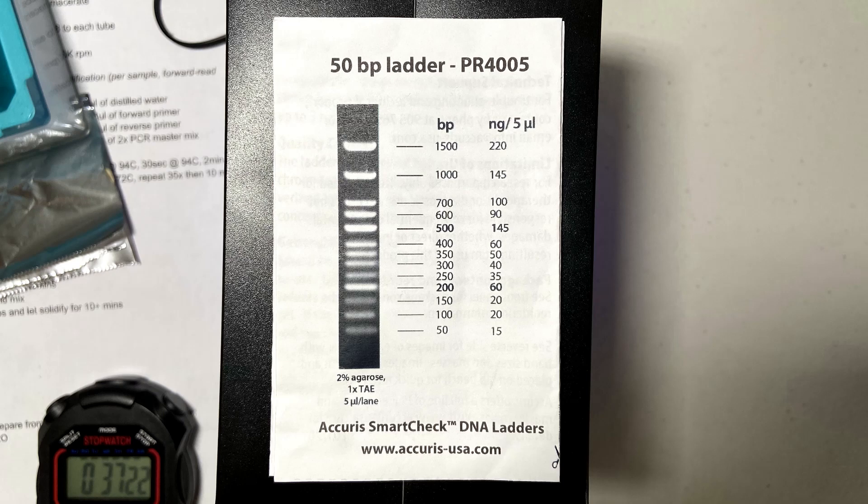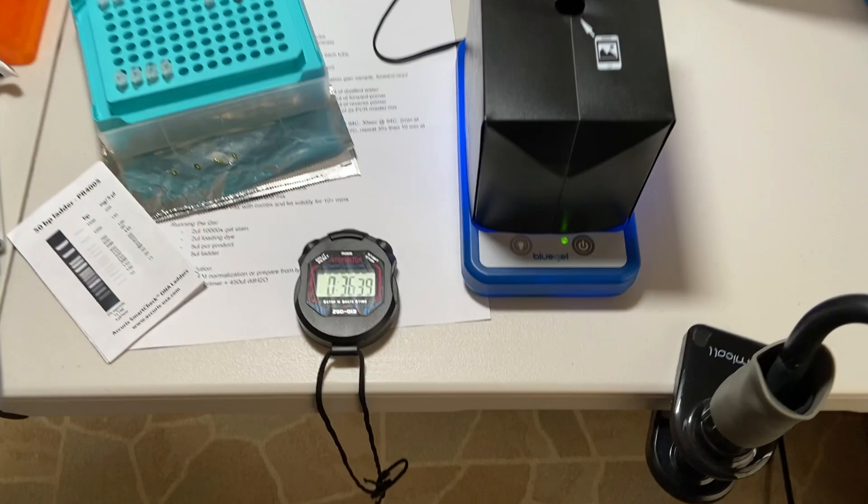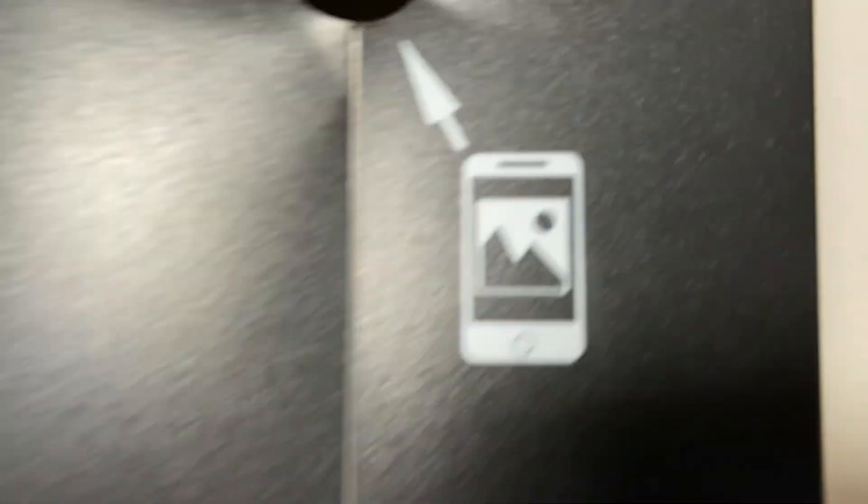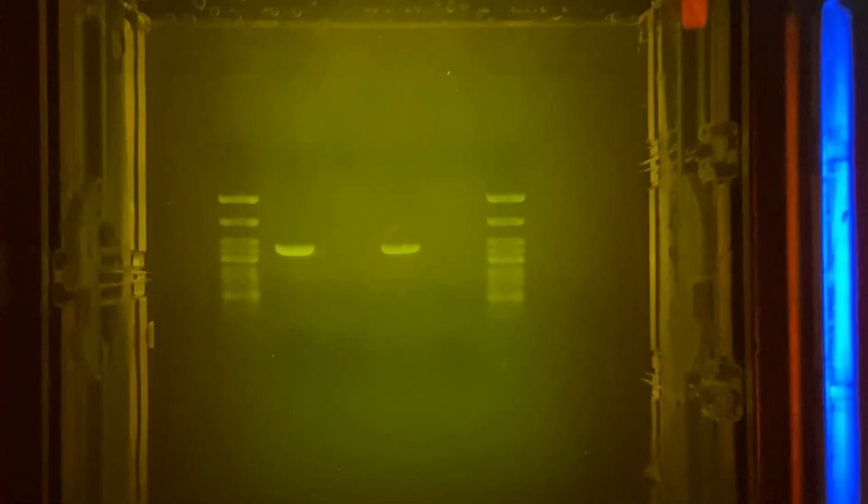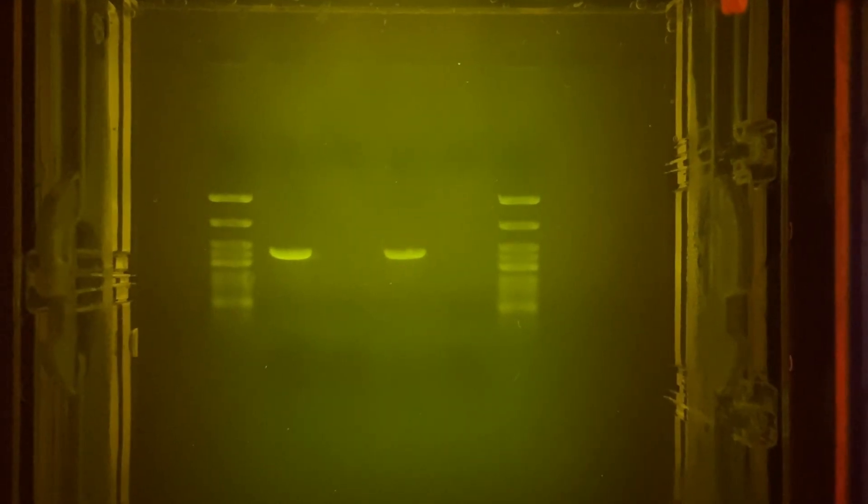Here you can see the reference for the ladder. This just shows you the reference bands that we can use to estimate the size of our PCR reaction product as well as the concentration. And this is the gel running. Notice the ladder on the end separating. And notice that in between we have two bands indicating a successful PCR reaction. And then the two other wells which are empty are the aspergillus, which as usual failed. And so after about 35 minutes, we have enough of the gel run to determine whether or not it was successful. And we can see that the reactions for 1 and 3 were.